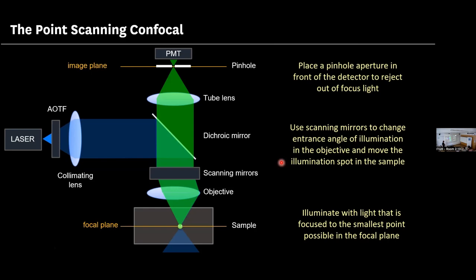And the numerical aperture of the objective will also dictate how thin your optical slice thickness is, so how thin is your depth. And you'll be able also to change the size of the pinhole to match.